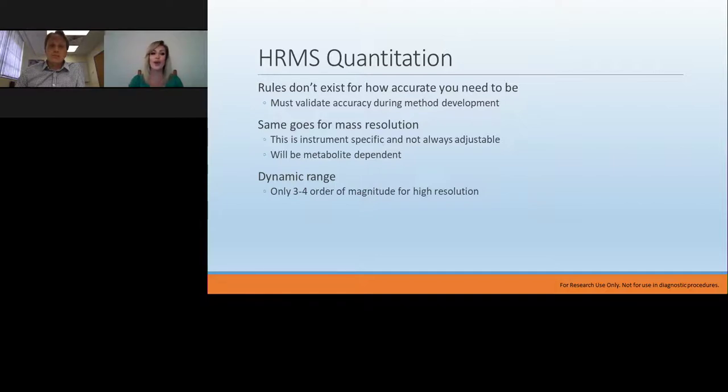Our next question is, why did you only show amino acids for your quantitation with labeled yeast extract? So far, the amino acids is just what we focused on as a way to do, say, interlab studies. And it's a good start, because if you can't quantify the amino acids within a run and within a metabolomic run, then you probably won't be able to do other analytes of interest. So they represent a good set of very well-characterized compounds that allows us to develop reference ranges that are consistent and measurable against clinical samples, and then also apply them to different studies. And so we don't want to just sit with amino acids. We will expand it to other ones, but as we do the validation, it's a good starting point for that aspect.